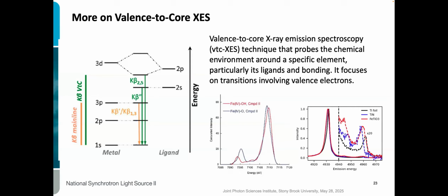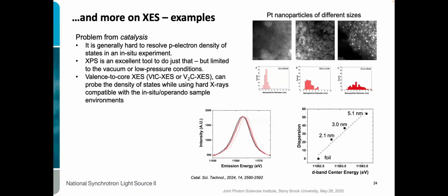This here is titanium foil, titanium nitride, and titanium, what is it, iron titanate. And again, there are dramatic changes, even though here you have nitrogens in the first coordination sphere, there you have oxygen. So it's a very sensitive technique. I'm going to skip on this one.